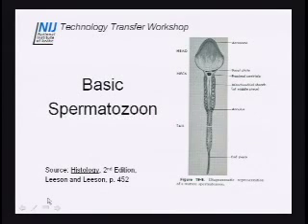I pulled this out of a histology book. This is a basic spermatozoon. Of course, for our purposes, mainly what we're interested in is the general structure of the sperm cell, the head, the neck, and the tail. A lot of times with what we're doing, most of the time, we don't even see the tail. So that's fairly important for us as forensic biologists looking at our Christmas tree stain slides. We really are having to look for that head and identify the head and make sure we've got a sperm before we're going to, let's say, do laser microdissection.